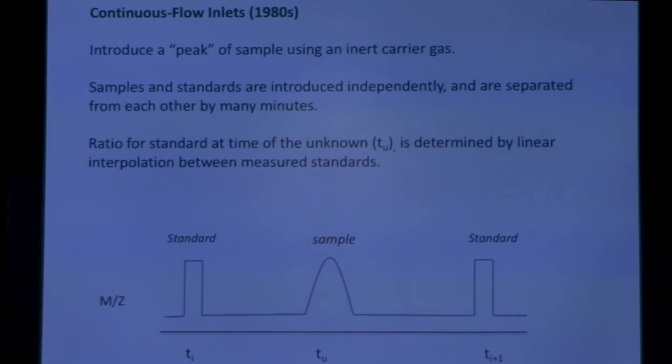So it's fundamentally different, but it provides that same ability to compare. The trouble is that from this time i to time i plus 1, you've got some possible drift in the ability of your instrument to make that measurement. So the accuracy still can drift. Even though precision is always pretty good, our accuracy can drift.